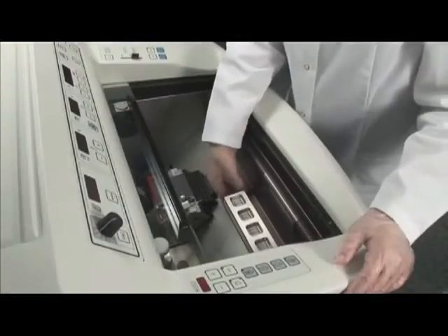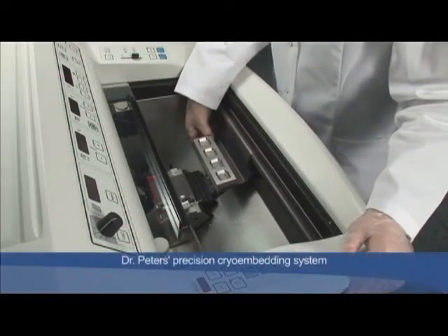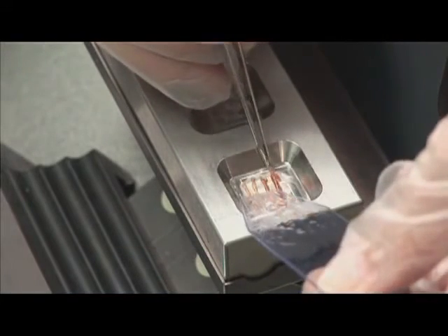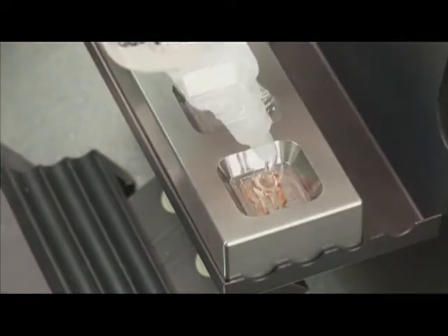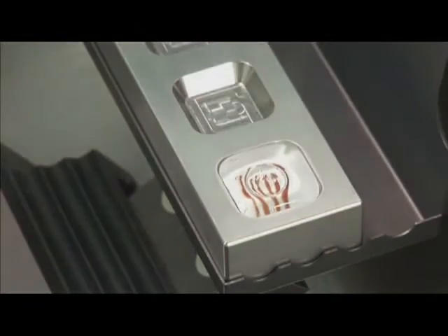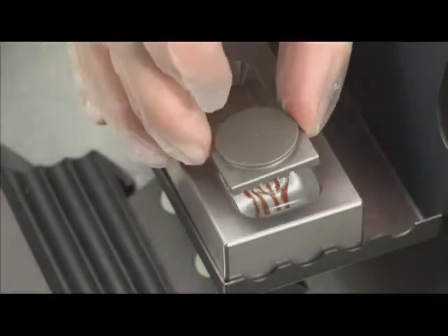The new Leica CM-1950 can be equipped with a precision cryo-embedding system developed by the American pathologist Dr. Steven Peters. This special system allows almost all types of tissue to be perfectly aligned and embedded.